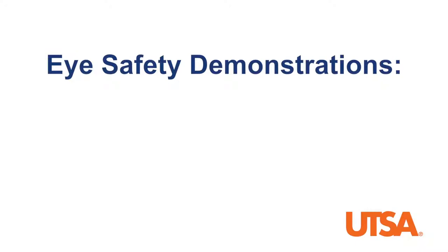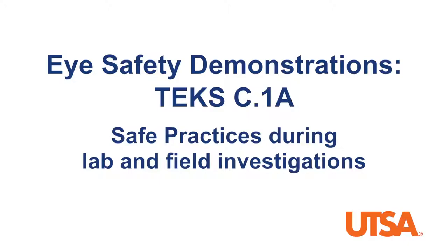Hi, my name is Chris DeSilvan, and I'm currently studying chemistry at the University of Texas at San Antonio. Today I'll be showing you some demonstrations you can use to emphasize eyewear safety in a classroom. These demonstrations correlate to TEKS C1A, which relates to safe practices during lab and field investigations.